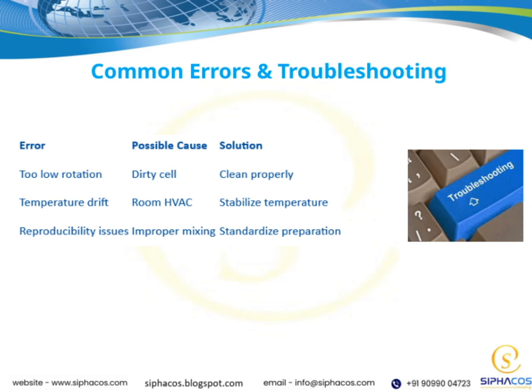Also, keep an eye out for common misconfigurations or overlooked steps, as these are frequent culprits. Remember, troubleshooting is about systematically eliminating possibilities until you find the root cause. By understanding these common errors and having a troubleshooting plan, you'll be better equipped to handle challenges efficiently. This ties back to our overall goal of ensuring smooth and reliable operation, even when issues arise.